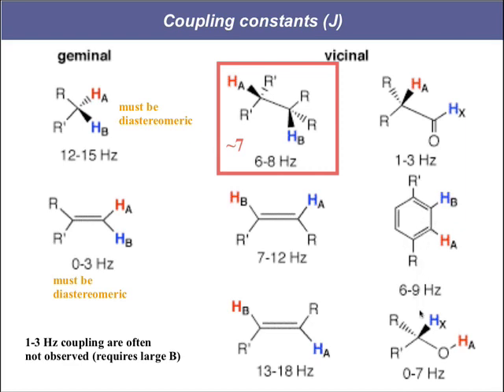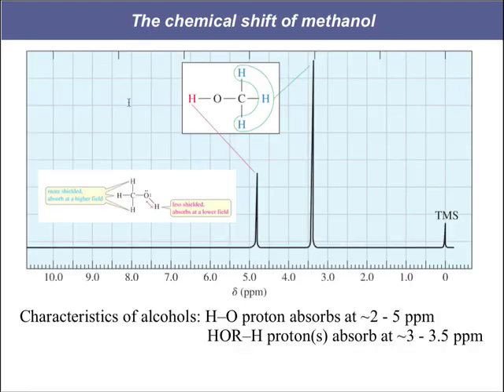And if you are on a hydrogen on an alcohol next to an sp3 neighbor, you can have as little as 0 splitting, meaning that technically this HA is a neighbor to this HX over here, but sometimes you get no splitting. In fact, when we looked at methanol, this H technically should split with these H's because they're neighbors. H's are on this carbon.